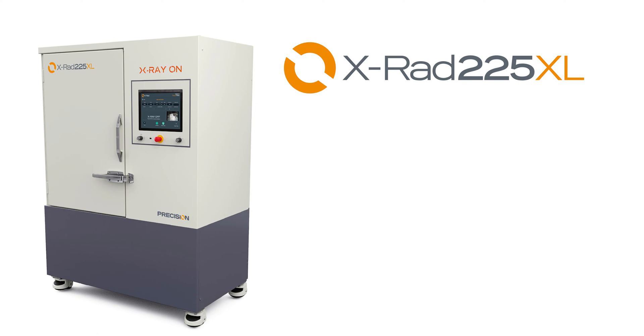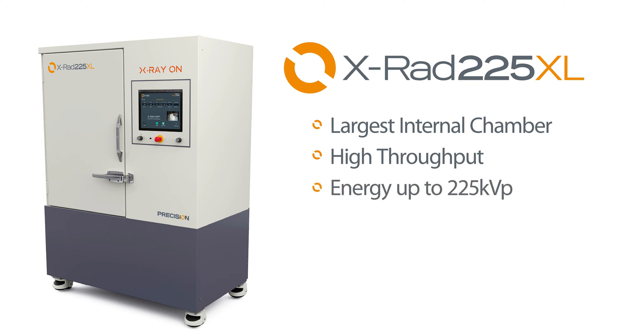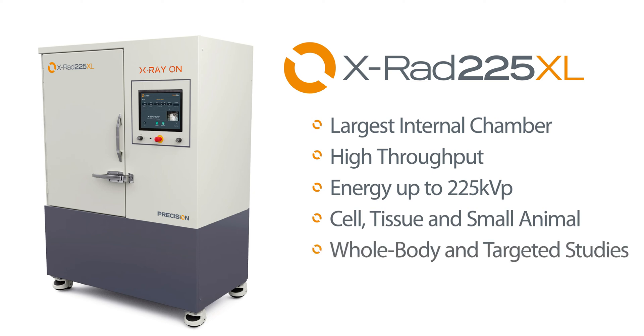Designed for biological or small animal irradiation, the X-RAD 225 XL has the largest inner chamber, allowing the highest throughput. With energy up to 225 kV, it's the ideal choice for larger cell and tissue cultures, and small animal studies, including whole body and targeted applications.